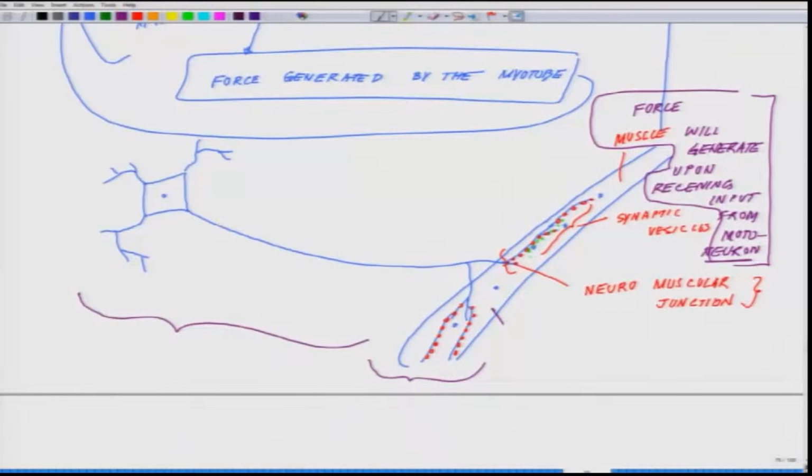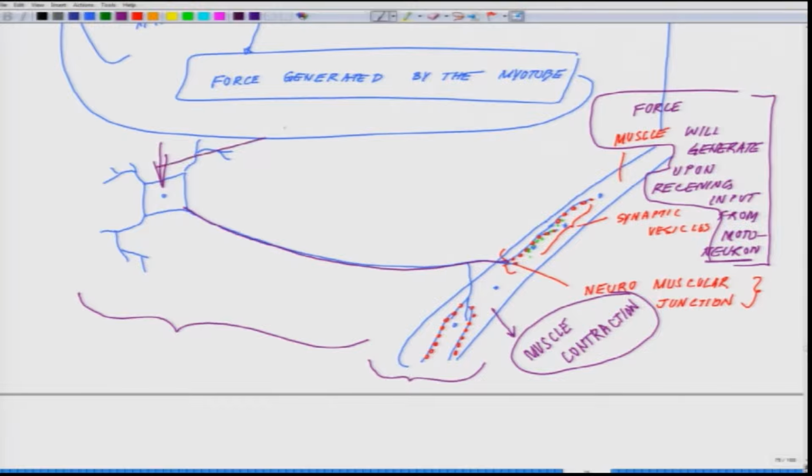So, now we know how we can measure the muscle contraction, but what we do not know is, if this muscle is not spontaneously contracting, how we can integrate it with a neuron which will make this muscle contract by sending a signal in the form of an action potential. Or, I put this electrode here to tell you, you can even stimulate the motor neuron.